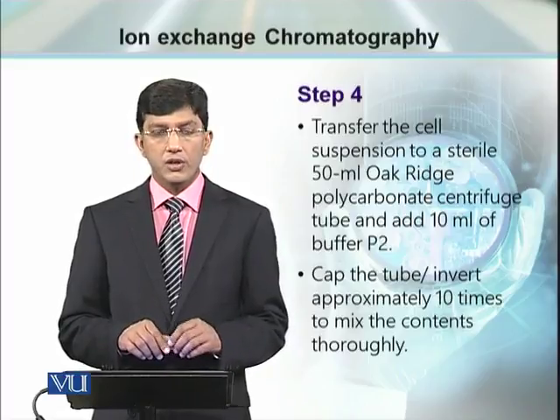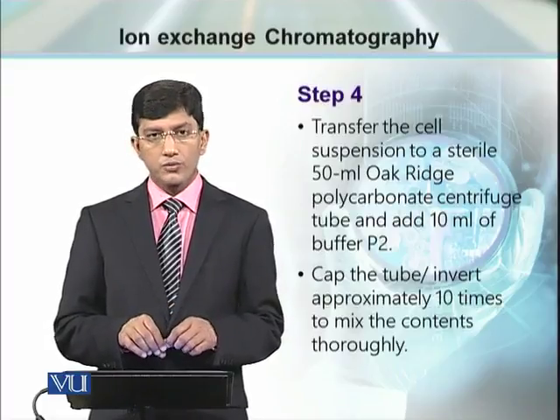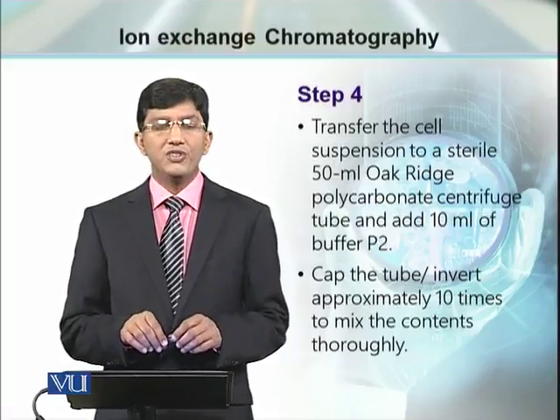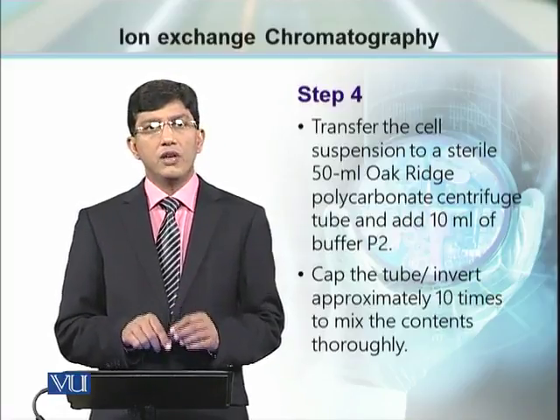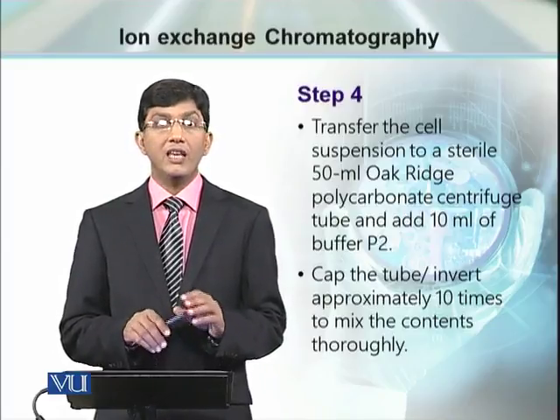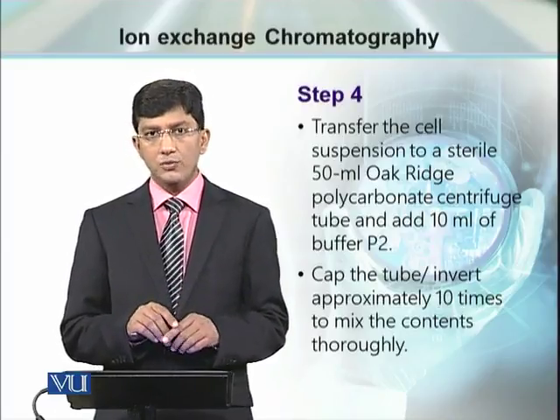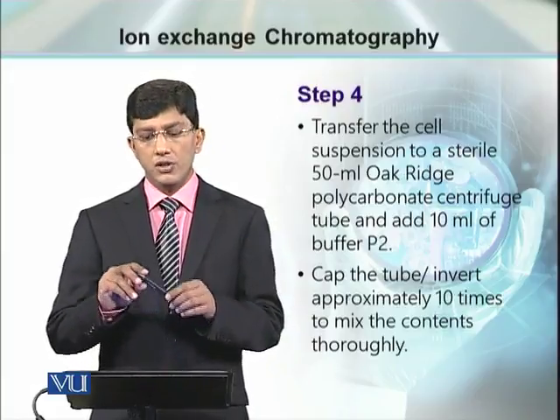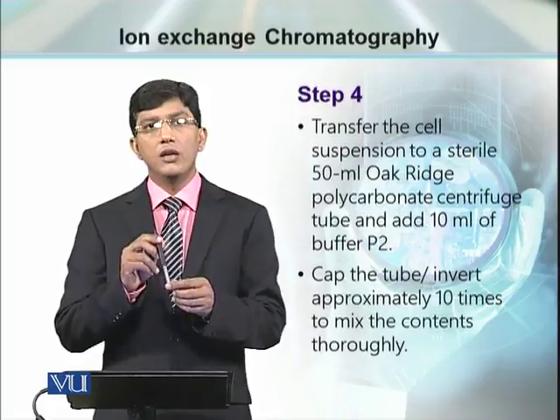Now this cell suspension in the P1 buffer is going to be transferred into a new 50 milliliter tube so that we can proceed further for lysis. The next step after harvesting is the lysis, and the lysis is done using lysis buffer, the P2 buffer. 10 milliliter or equal volume of lysis buffer is added to the bacterial cell suspension, and we can mix this P2 buffer with the cell suspension by simply rotating the tube up and down.